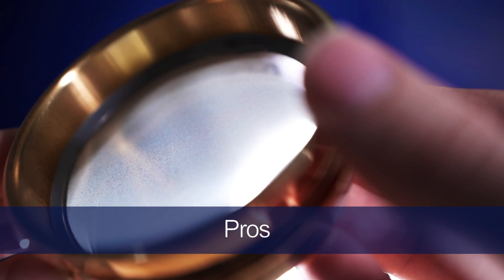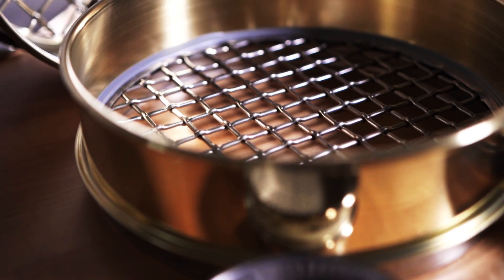The biggest pro of brass mesh is that it's anti-sparking. The most essential part of test sieves is the consistency of the mesh opening. Since brass material is softer, brass mesh will deteriorate more quickly than stainless steel, so if you want consistent results you're going to have to replace them a little more often.